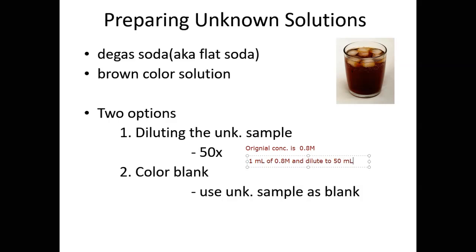So now the dilute solution would be 1/50th the original concentration. So that would be 0.016 molar. So that's how you do a dilution, diluting a sample by a factor of 50.